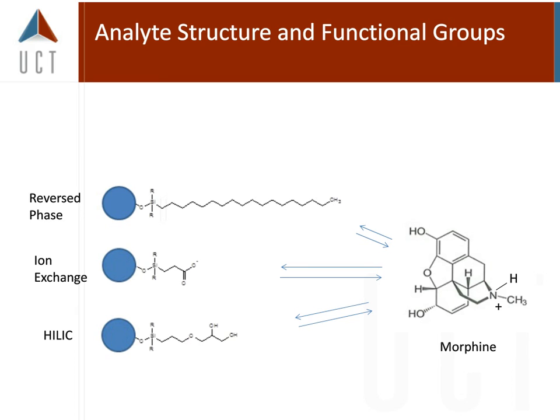Also, we're going to be talking about the solvents that are being used. Again, a common connection between solid phase extraction and LC is that acetonitrile and/or methanol are usually the organics used for washing columns and sometimes eluting, but you also have buffers that are used to put a lot of these samples onto the columns. So again, the similarities in mobile phases: methanol and acetonitrile are organics, and water or some sort of buffer are part of your LC gradient.